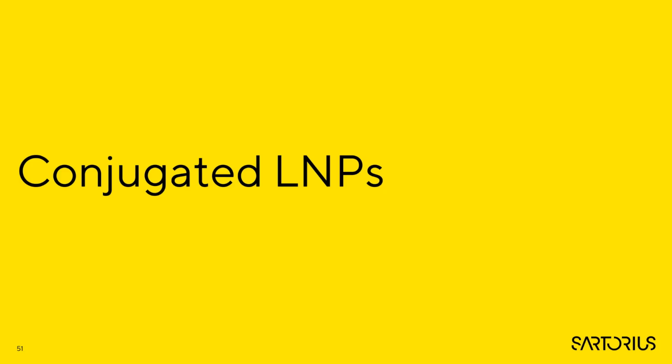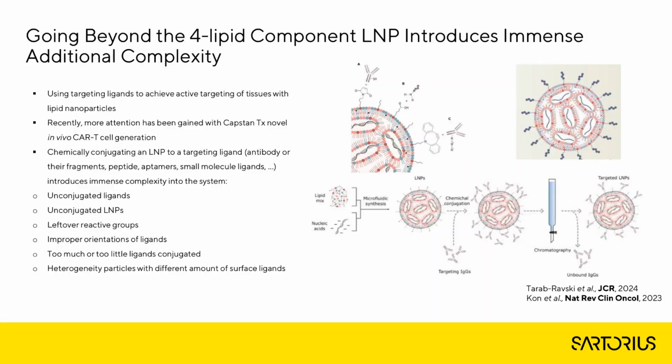Now, to move slightly further into a more complex mixture, let's talk briefly about conjugated LNPs and what the challenges within that field are. That field definitely has a big challenge of CMC because of all the different processes that you need to do to form such a product.